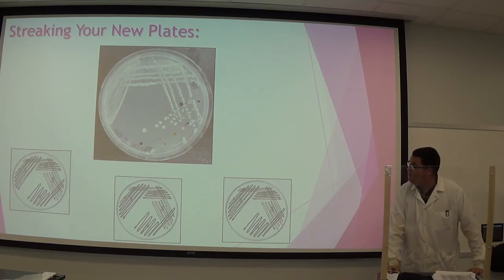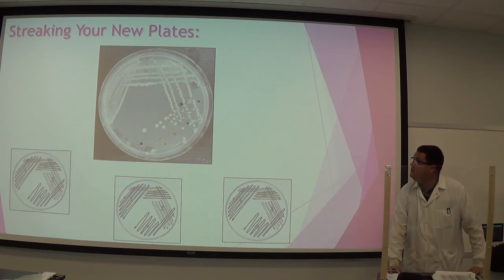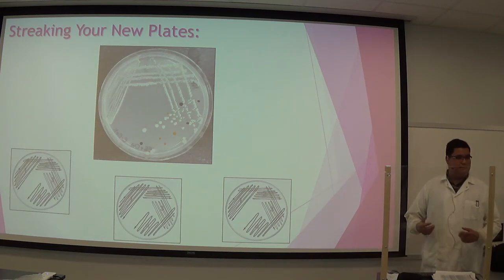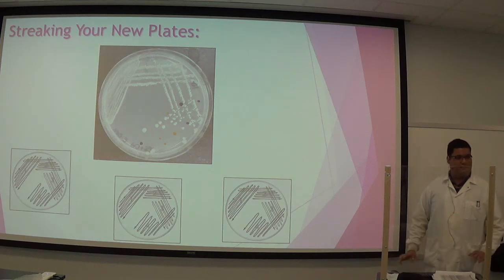last week. When you have the bottom plate, which is the plate that has the actual media on it, when you write your name on it, make sure you write along the outside, because if you start writing on the center, you'll be blocking your view of some of these colonies. So just write your name on it. Again, when you finish it up, put the plate upside down inside of the bag that's inside your box, and just put that in the box and you're free to go.